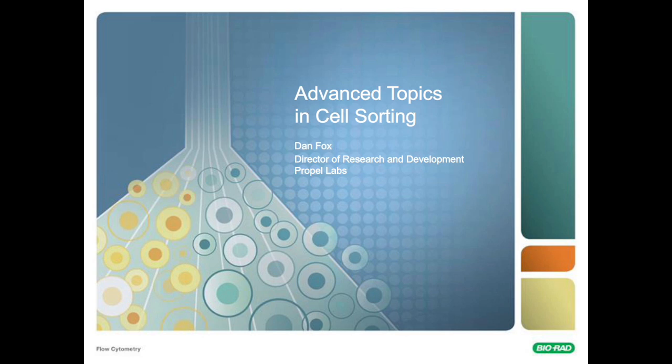So the webinar will last approximately 1 hour. Dan Fox from Propel Labs will be presenting on the general concepts in cell sorting, sort modes, cell sorting performance, and discuss sorting speeds. Following the presentation, we'll have about 15 minutes of live questions and answers with Dan.